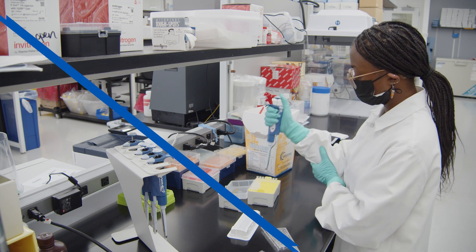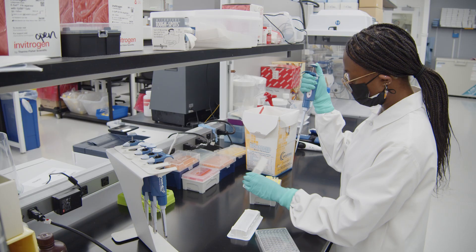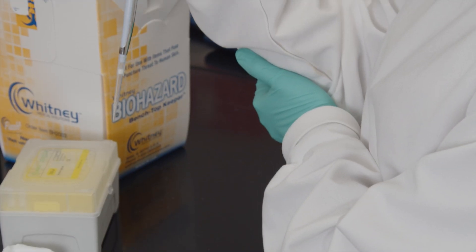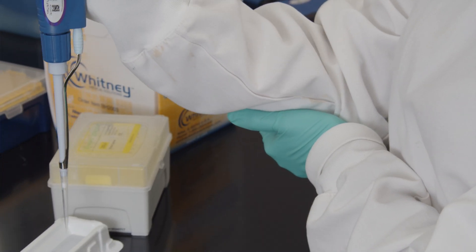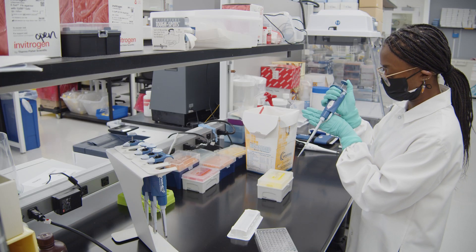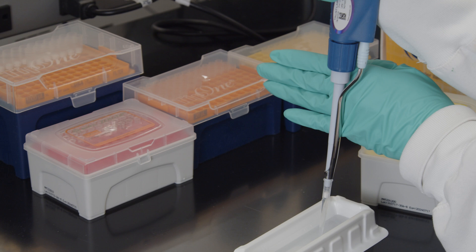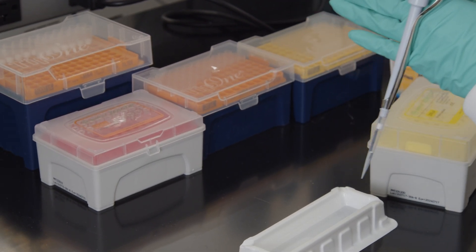You can also stabilize your pipetting hand with your free hand, holding your pipette hand somewhere comfortable between the wrist and the elbow. Or, use the back of your free hand to guide your pipette. Adding another point of contact can help to eliminate any wobbles or shakes.